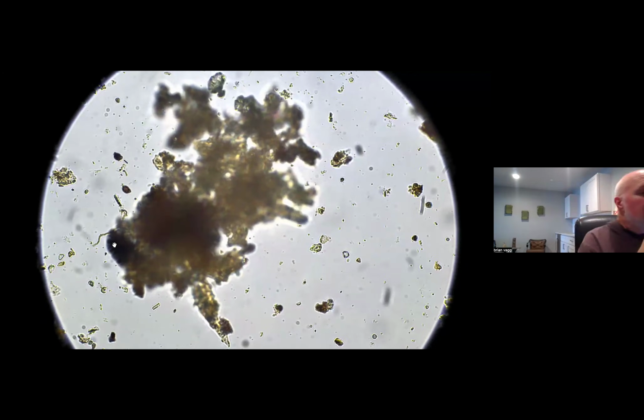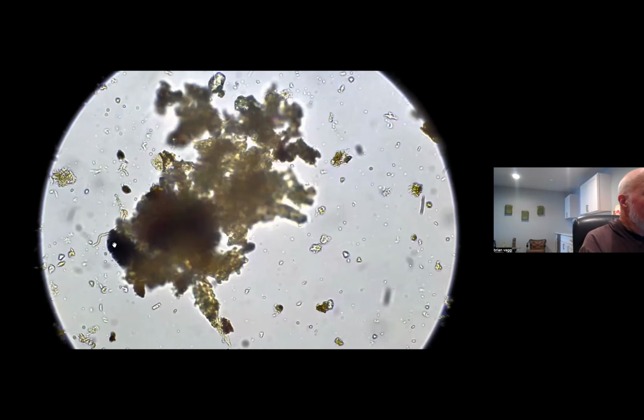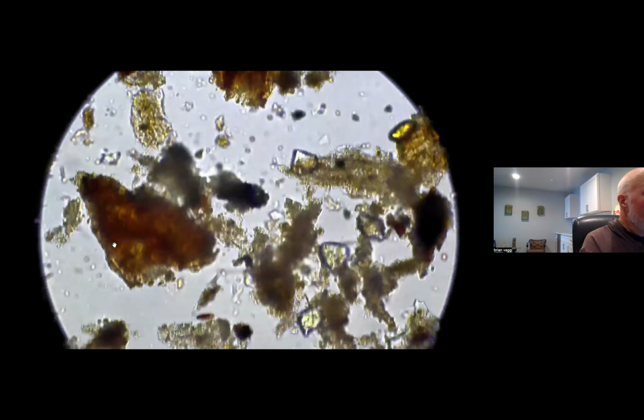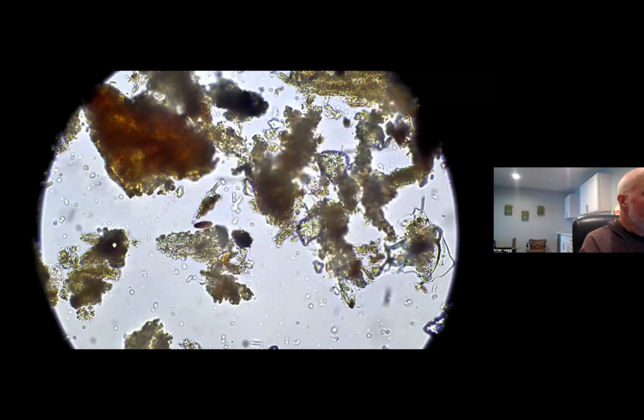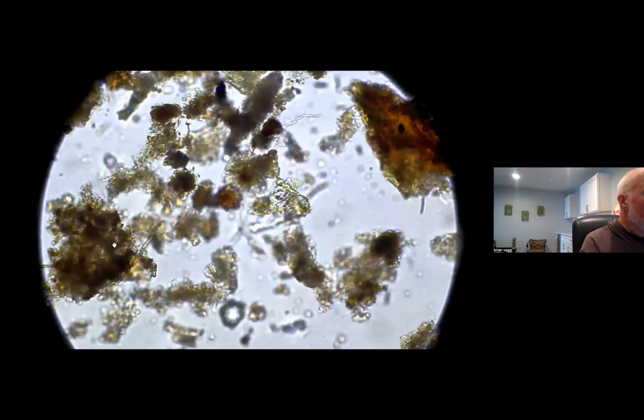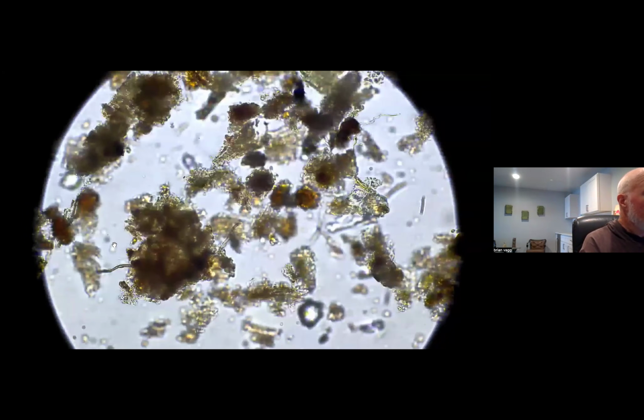All right. So as Keisha was saying, there's some life in the soil here. We just saw a nematode, we got testate amoebas, we got fungal hyphae, you saw a flagellate earlier on the screen. So overall, I'm pretty happy with the way that this soil is actually coming about.